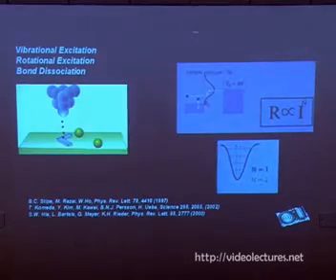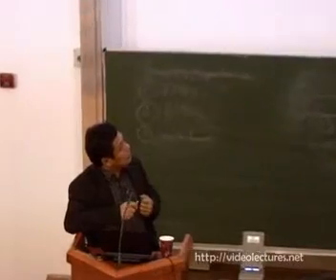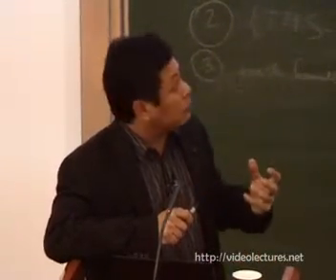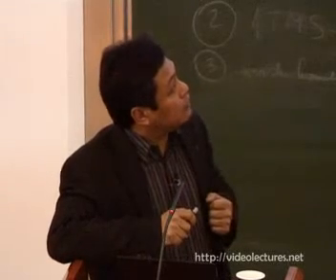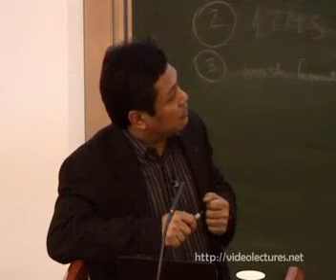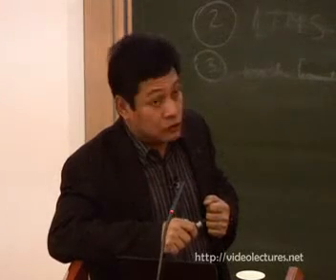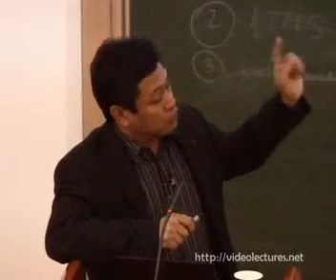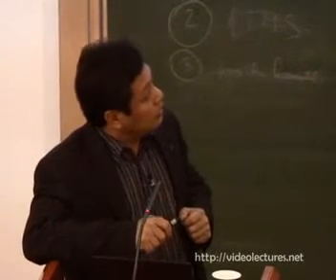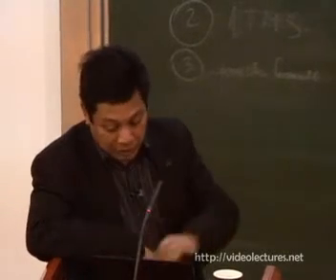And how do we control that? What we have to know is that when we inject the tunneling electrons into the molecule, the electron is temporarily captured in excited states and energy is transferred to the molecule. And we can control this energy transfer. From this diagram, you can see here, we can excite by using single electrons or multiple electrons, depending on the situation. And we know how many electrons are involved in the energy transfer process from this equation. Transfer rate is proportional to the current to the power n. Here, n is the number of electrons involved. So please remember this equation, rate proportional to the current to the power n, because I will come back to this at a later point.